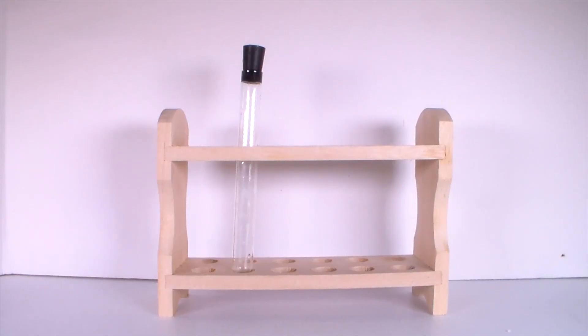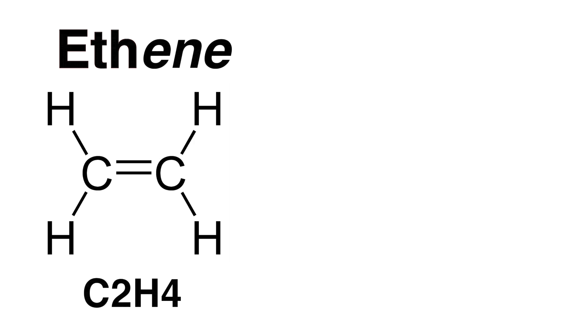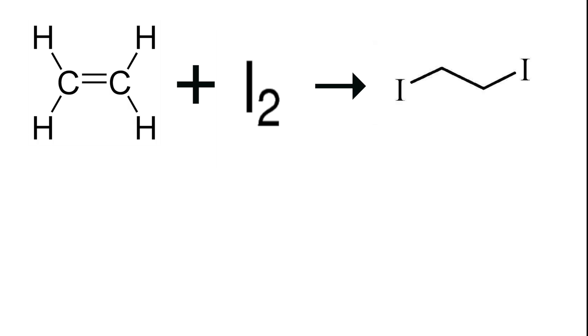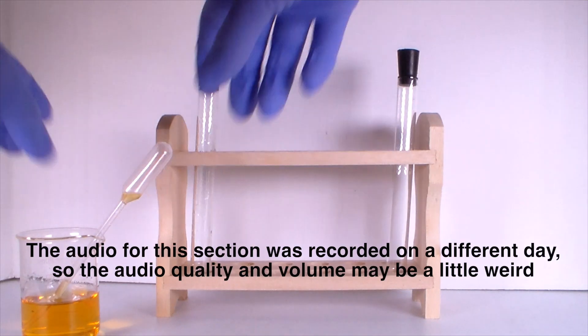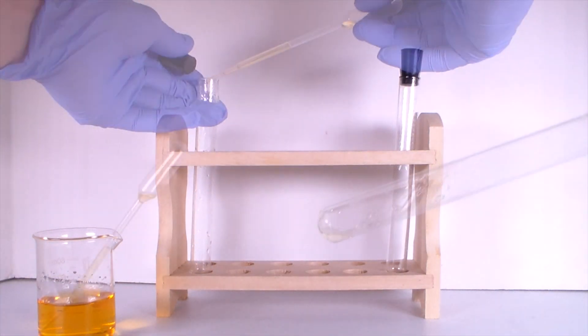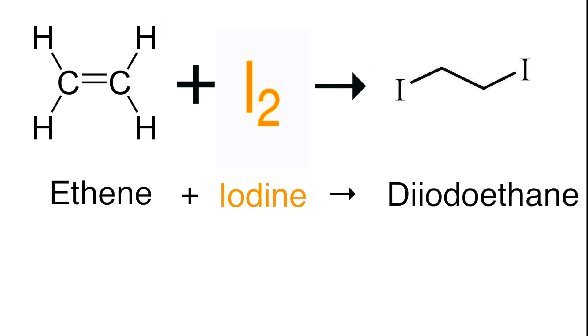You might be wondering, how can we be sure this is ethene and not ethane? Remember how I said earlier that ethene is more reactive than ethane? Well, we can actually use its reaction with iodine to test it. Ethene reacts with iodine forming diiodoethane, but ethane does not react with iodine. So, to test the gas that we produced, I add a few drops of dilute iodine water to the test tube. You can see that it starts out as a pale yellow-orange color. However, after shaking the test tube, the solution becomes colorless. What has happened is that the yellow-orange iodine is reacting with the ethene to produce diiodoethane, which is completely colorless.